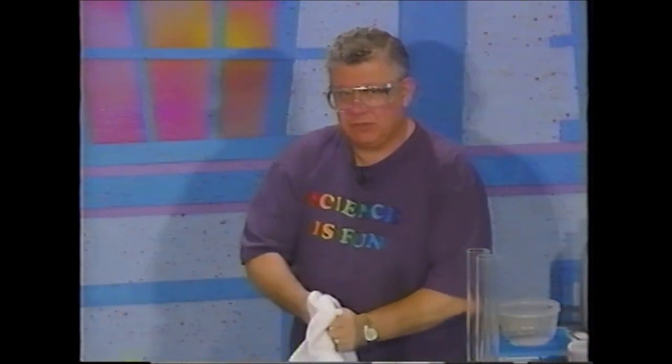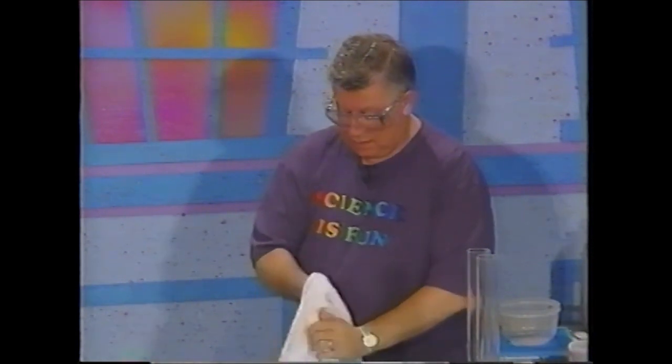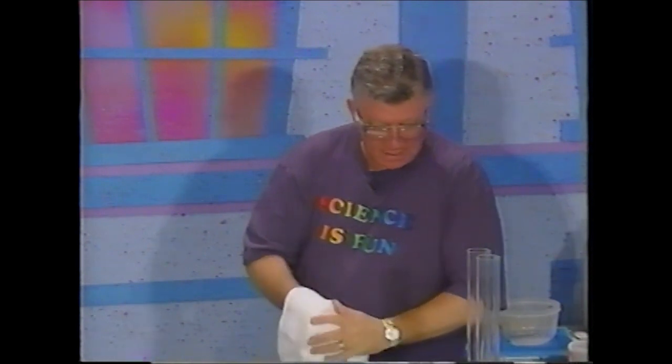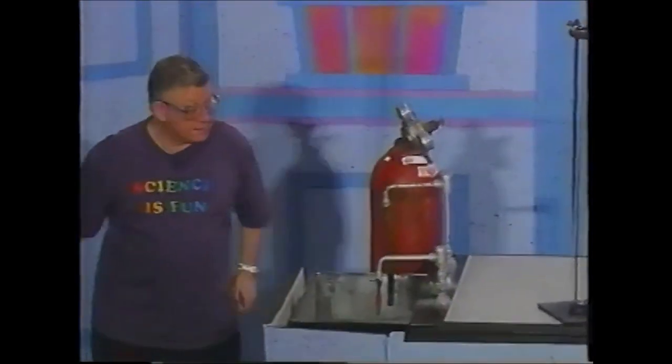The next experiment we're going to do involves a gas and a volatile liquid. And this experiment is going to be done by using a match that I'm going to strike first and then drop into a long glass tube that has in it the mixture of the gas we call nitric oxide, and the volatile liquid is called carbon disulfide. And I'm going to try to do that where the tube is, of course. I can't do it anywhere else.